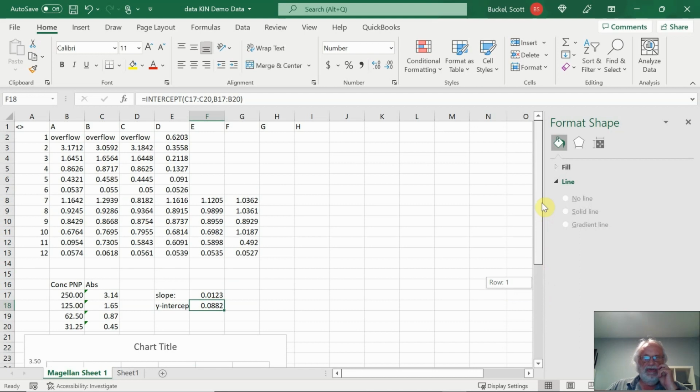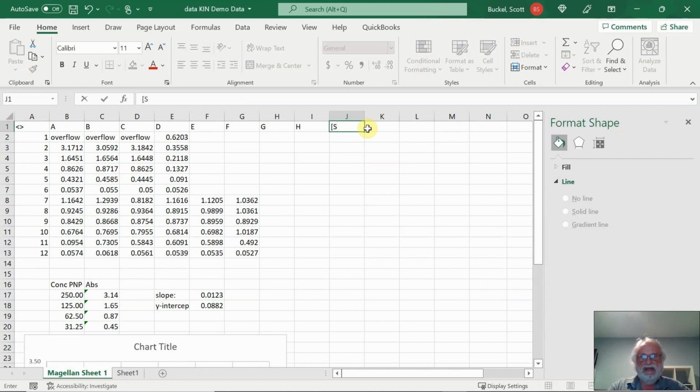So what I'm going to do is I'm going to go through and look at the mutant data and go ahead and start generating some plots and graphs here. A lot of times what I'll do is I'll take each step along the way to do the graph. So here I'll go ahead and put substrate concentration. This will be wild type absorbance values.